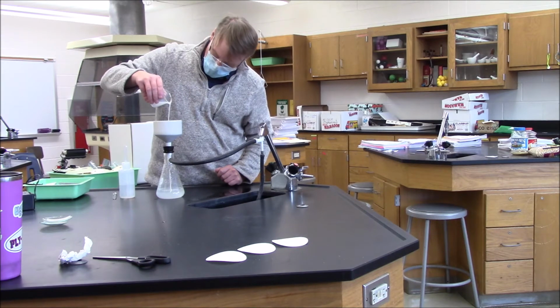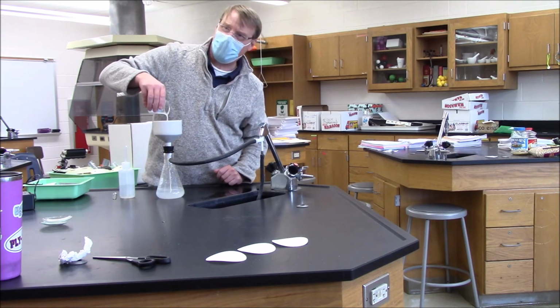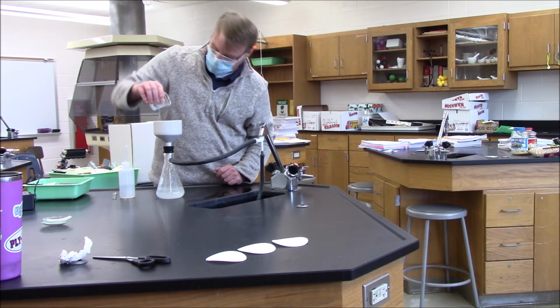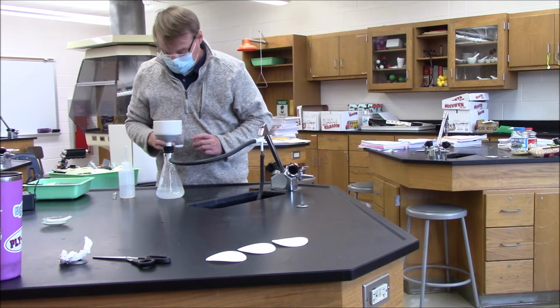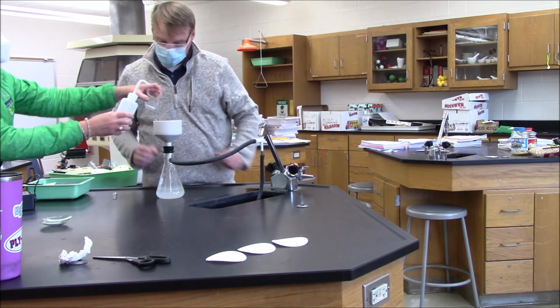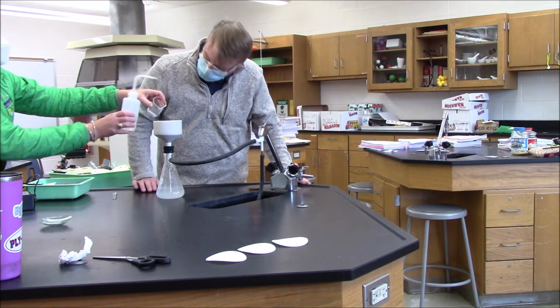So it's white when it's going in, but it's more or less clear coming out. Is that fair? Right. What we're taking away is the water, so we want to keep the stir bar in there. Now what you're going to do, I'll show you real quick. You're going to have it on an angle and you're just going to rinse.